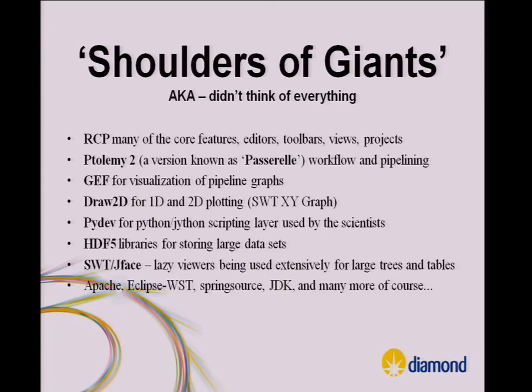Some of the things we use draw 2D XY graphs. I believe the XY graph project has just become part of Eclipse Nebula, so it's Eclipse Nebula Visualization. But we've been using that for some time, and we think it's great. Obviously, we use all the other stuff.